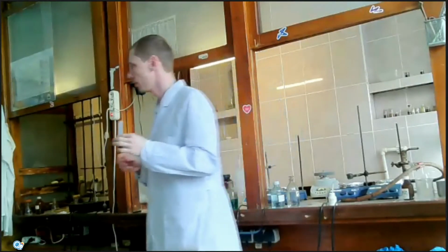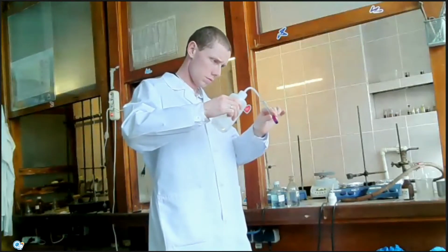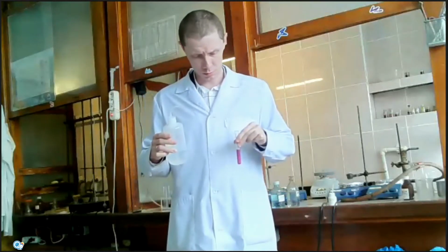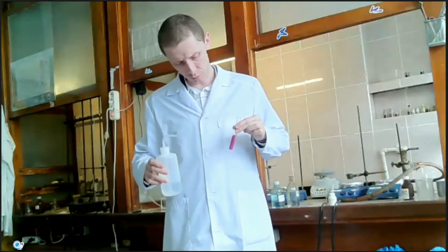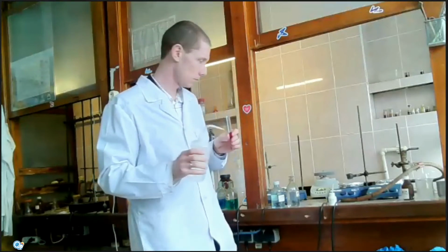But if I dissolve this mixture, for example, by using distilled water, color becomes pink like at the start. Also because this reaction is reversible, if I add water, more starting materials, this reaction goes backward.